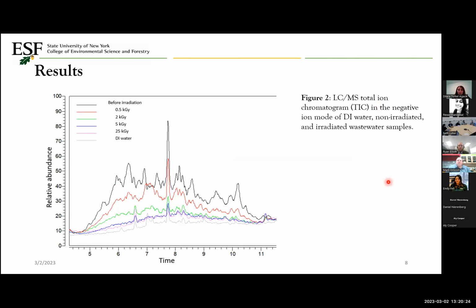All right, so this is a TIC chromatogram, which shows the total ion in the sample. This chromatogram is created by summing up intensities of all mass spectral mass peaks belonging to the same scan, and the black peak stands for the non-irradiated sample. It has the highest amount of ions. That's why it has the highest area under the peak in comparison to the other peaks, which are shown by red, green, purple, and pink.